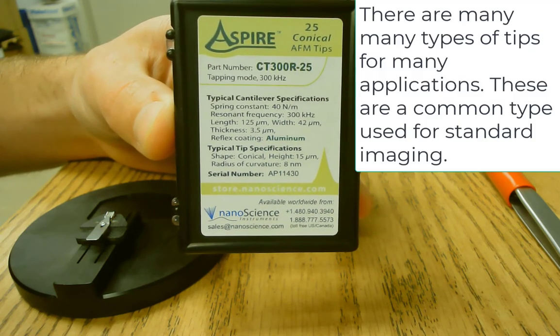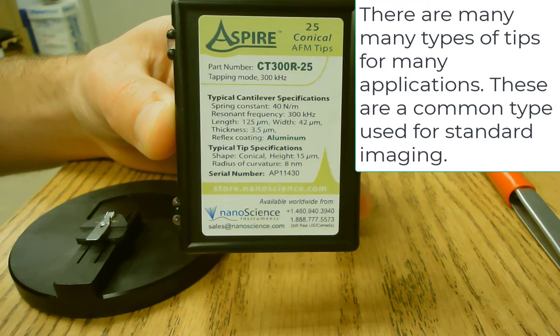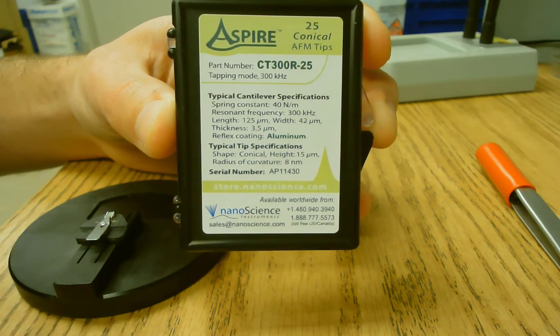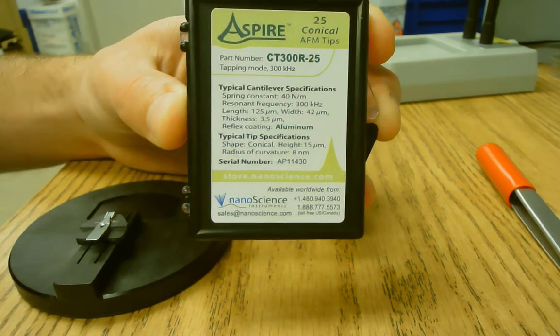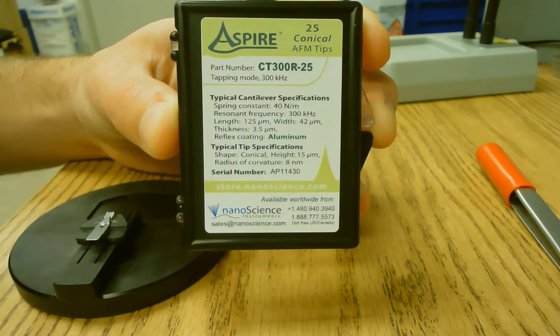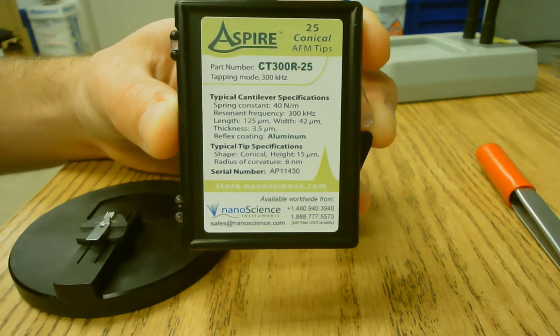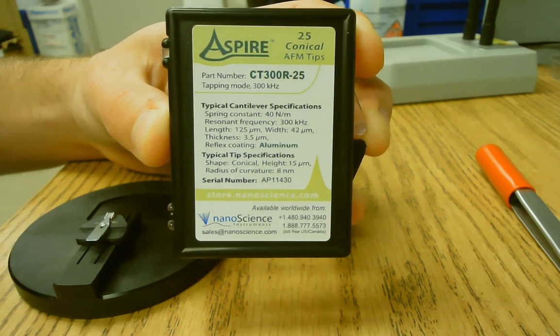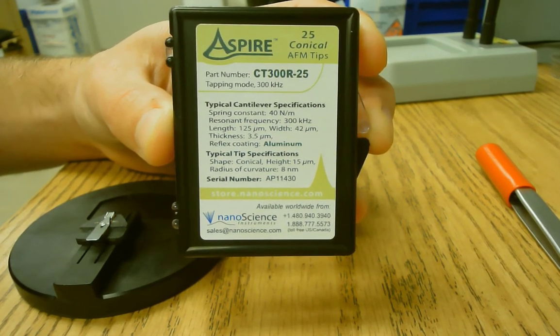So the specifications are listed here. You can see there's a lot that goes into these tips. They even measure the spring force constant. They have the approximate resonant frequency listed. The length and width of the cantilever as well as thickness. The reflex coating.